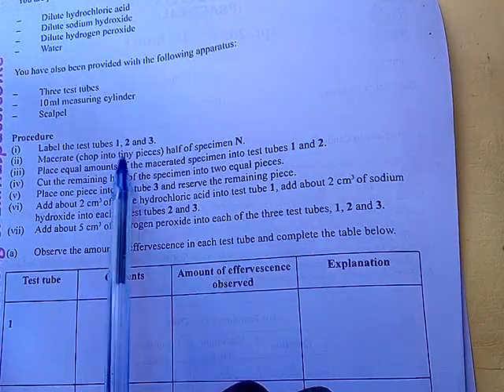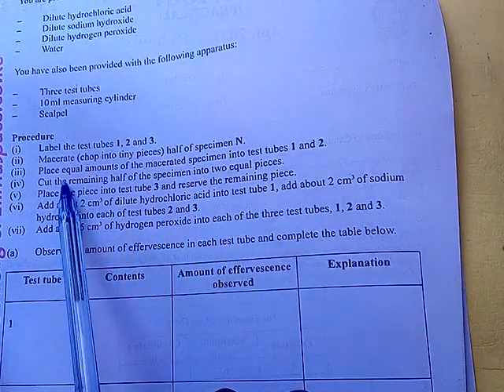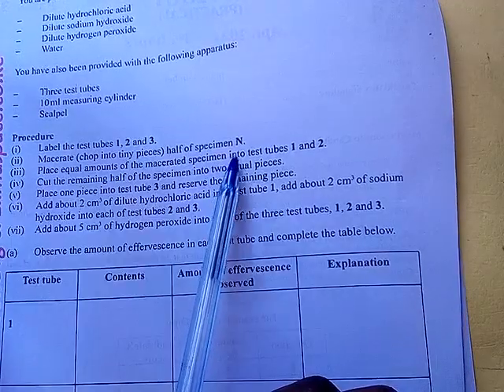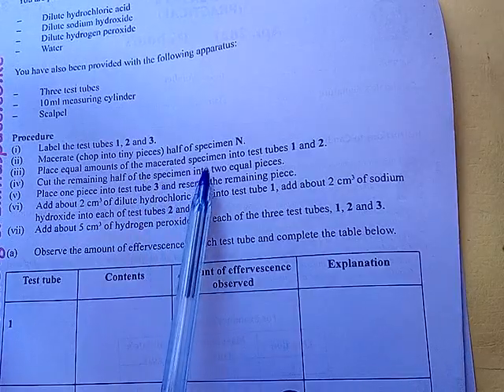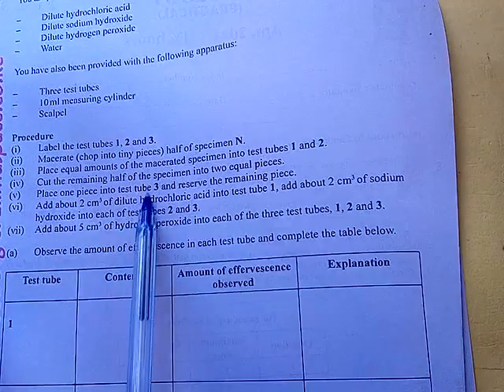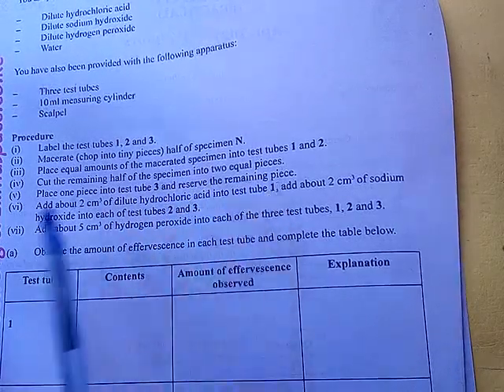Macerate or chop into tiny pieces half of the specimen N. Place equal amount of macerated specimen into test tube 1 and 2. Cut the remaining half of the specimen into 2 equal pieces. Place one into test tube 3 and reserve the remaining piece.